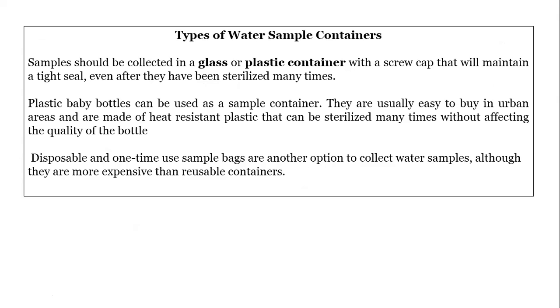So for plastic bottles, which we need to collect, some of these bottles are available with graduations already, maybe in mils, some up to 500 mils, some up to 1,000 mils. They already have this calibration in these containers. And these plastic containers usually are more heat resistant, so they are preferable and used in the laboratory, while we also have glass bottles.